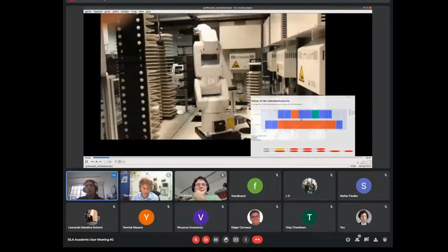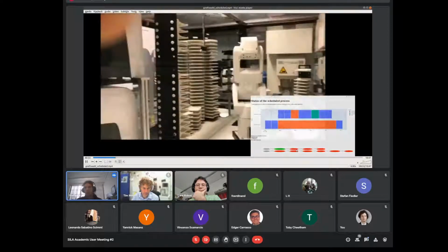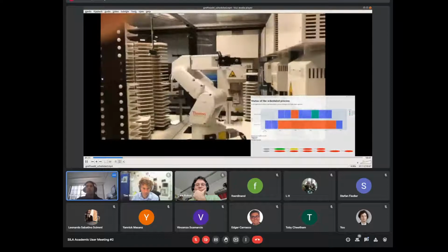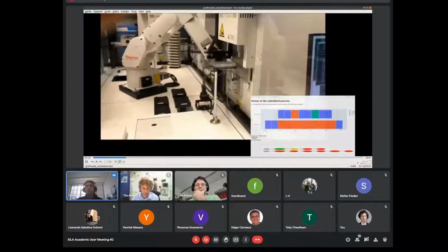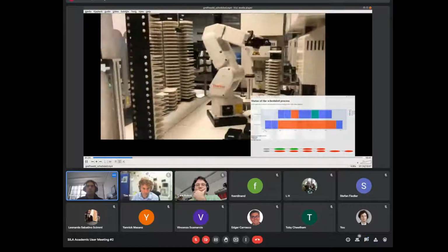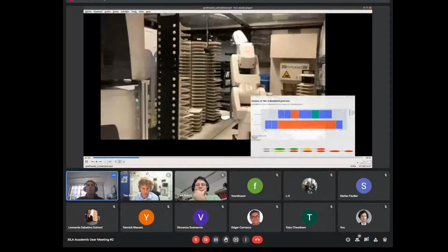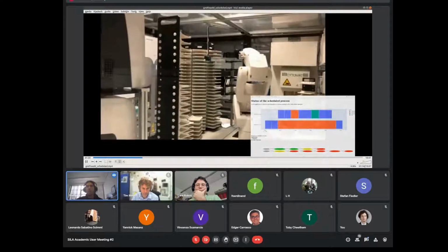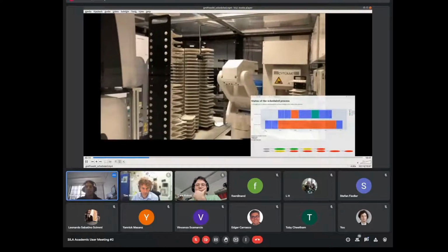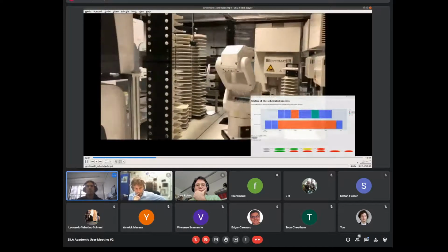The upper one is how it's supposed to be, and the lower one is what actually happens. This is four times the actual speed of the video. Actually, the robot has the capability of being twice as fast as you can see it, but it actually gets quite scary.